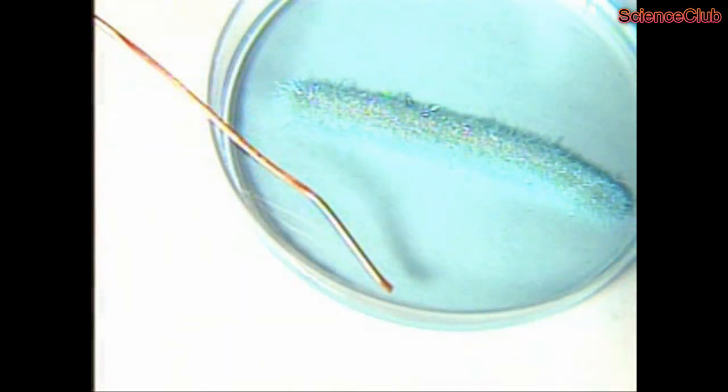Here we see the contrast of the original copper wire to the wire after it has been in the silver nitrate solution. You'll also notice that the solution has turned from clear to pale blue. The copper metal has become the copper 2+ ion in solution, resulting in the blue color. The silver ion solution has become crystals of silver metal.